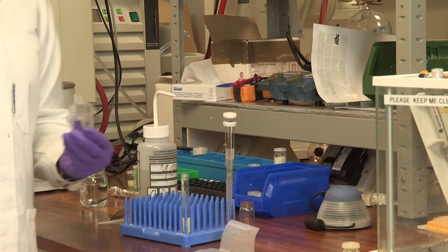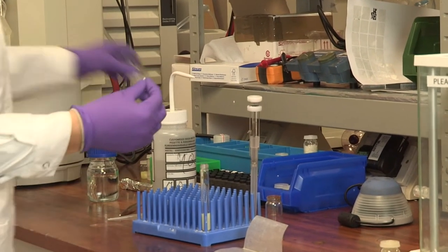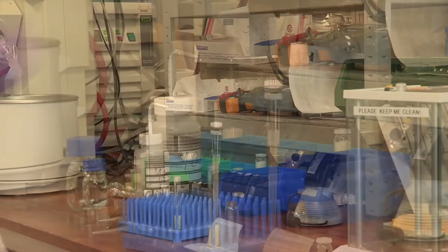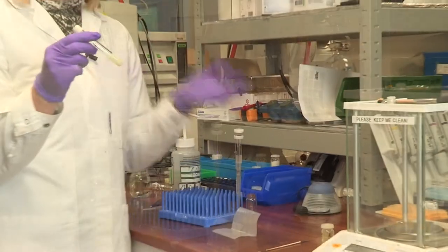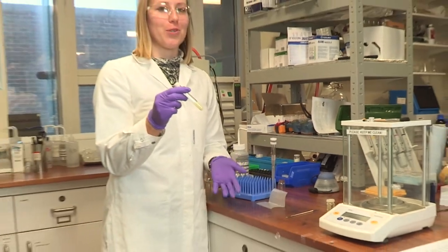Now I'm just adding a stir bar so we can stir while we run our reaction, and sealing the vial. There's our sample — we'll just stick it under sunlight to start producing hydrogen.